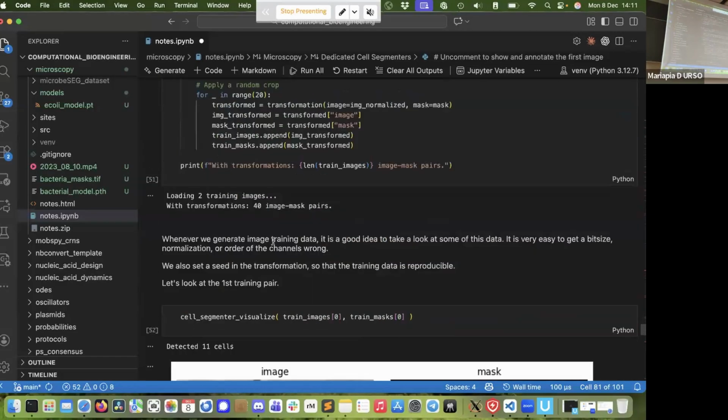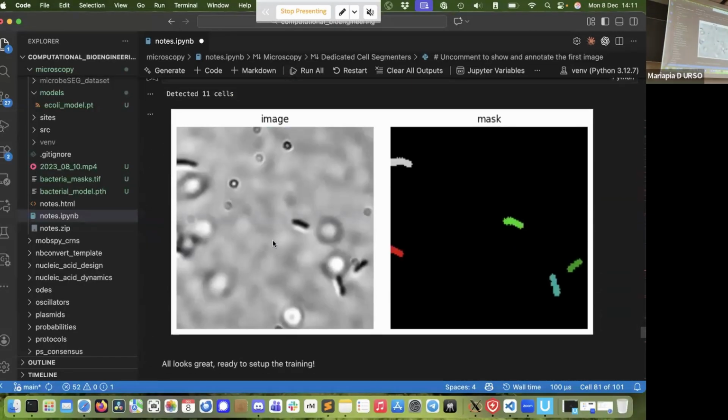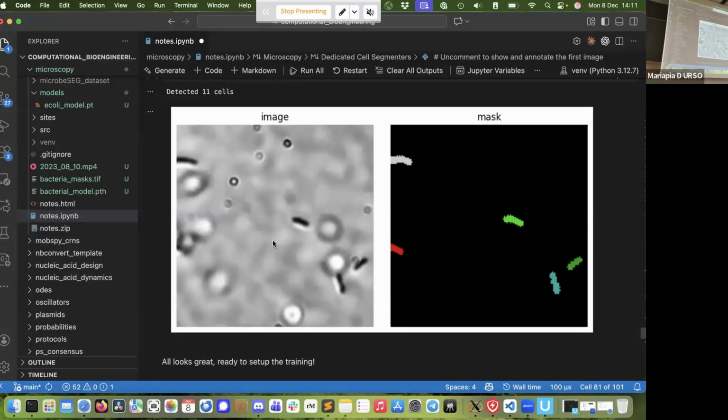Okay. And this is how it looks after segmenting. This is the training data set. Of course, like you see, this is already a crop because we used the transformation library. I mean, we segmented 2 images. This is clearly not a good idea for deep learning. So we have tons and tons of generated images from rotating, flipping, cropping, and doing fun stuff. This is how we got, for example, this image here.